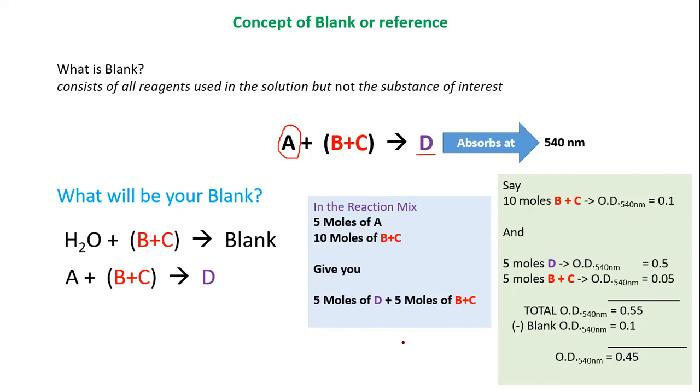So are you preparing a good blank for you? Do you feel that this is a valid question to ask? Right. Did you ever pay any bit of attention to understanding how blank is prepared?